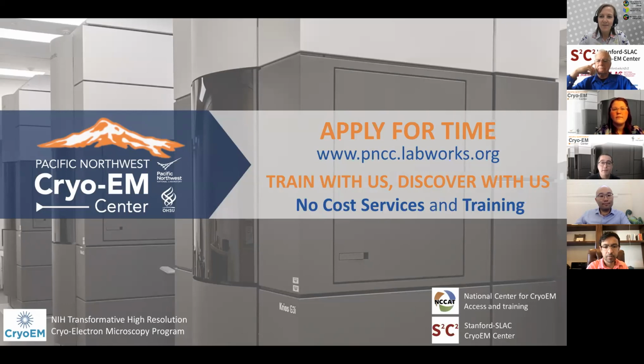The PNCC has 5 microscopes. We have an Arctica with a K3, a Krios with a Falcon 3 and a K3, 2 Kriosés with a Falcon 3 and Bio Quantum K3, and 1 Krios with a Falcon 3 and Bio Continuum K3. And for sample preparation, we have a Vitrobot, a GP2, and a VitroJet that's undergoing internal validation, but will be offered to users once that's complete. While we're still under some on-site restrictions, we're offering one-on-one remote trainings and small remote workshops. And we hope to have visitors on site soon again to offer workshops for sample preparation and microscope operation. We hope to work with you soon. Thanks.